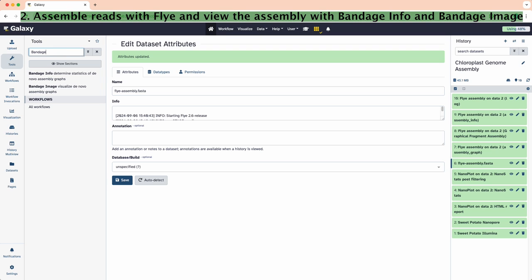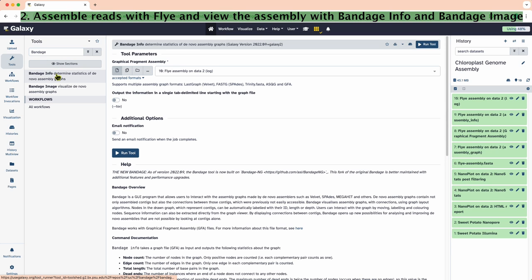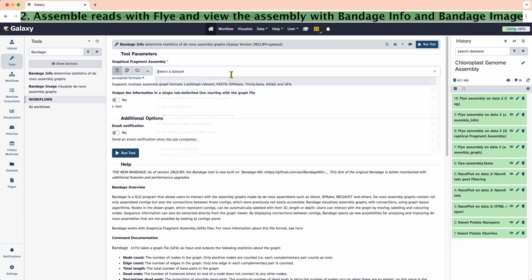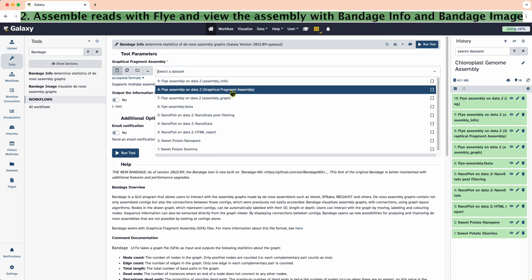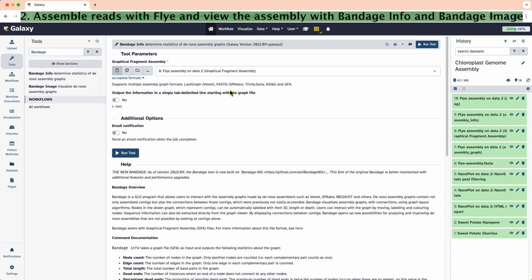Lastly, we can visualize the assembly using the Bandage Info and Bandage Image tools. Make sure to use the graphical fragment assembly output file for this.